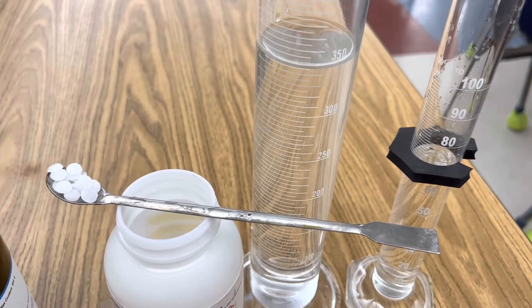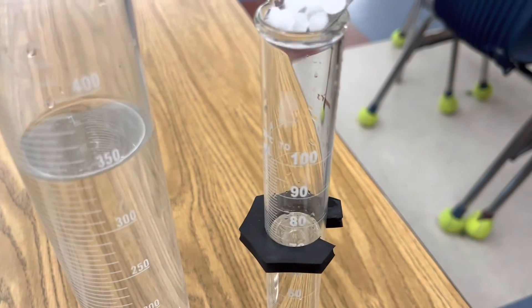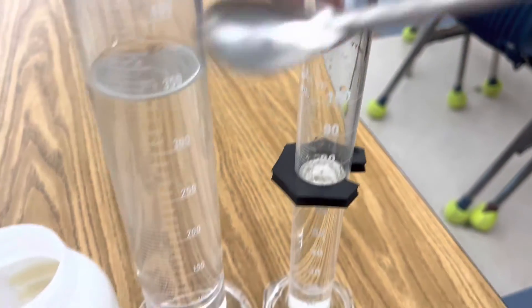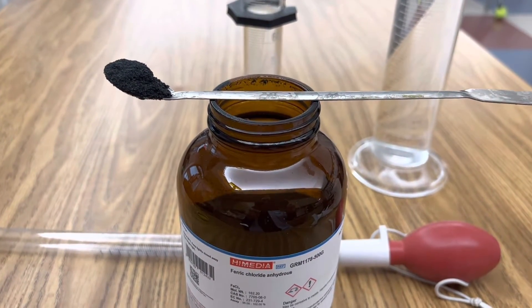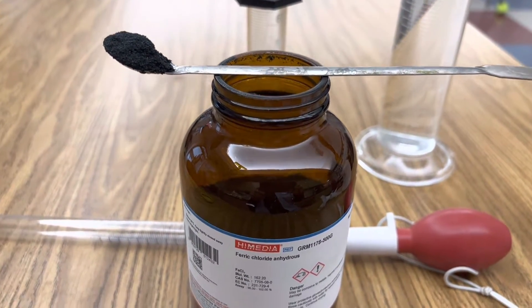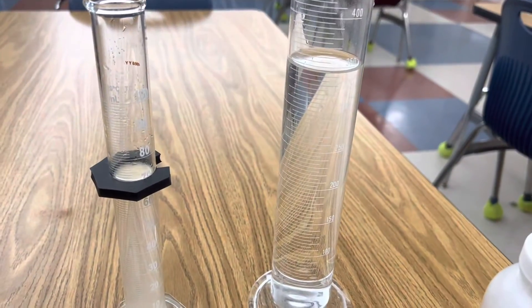First I'll create an aqueous solution of sodium hydroxide by adding 8 grams of sodium hydroxide to 70 milliliters of distilled water. Next, create an aqueous solution of ferric chloride by adding 12 grams of ferric chloride to 350 milliliters of distilled water.